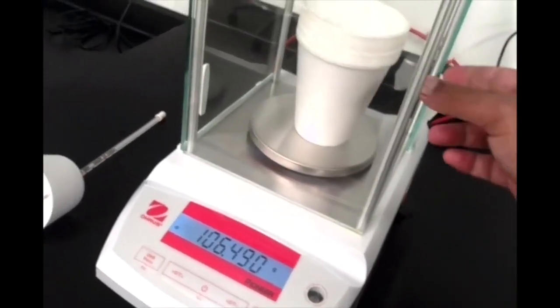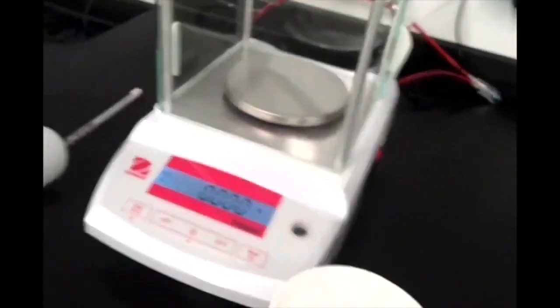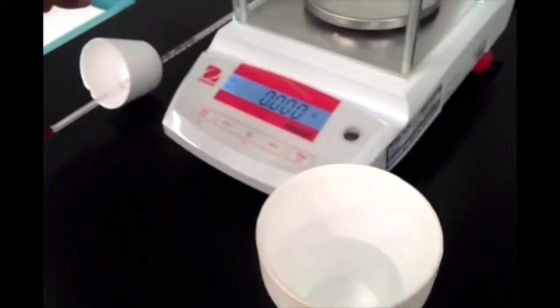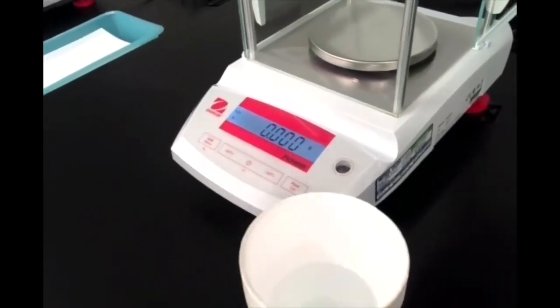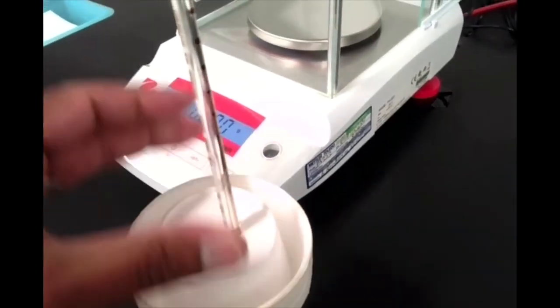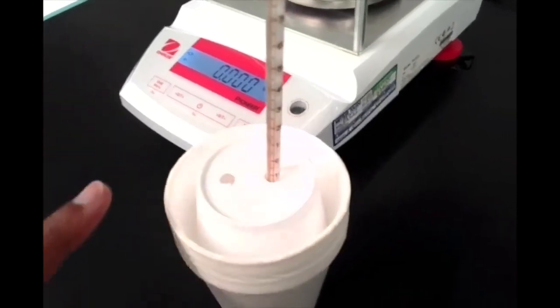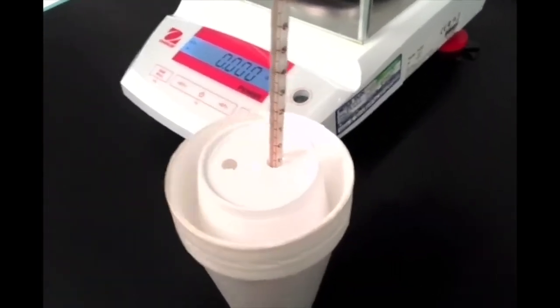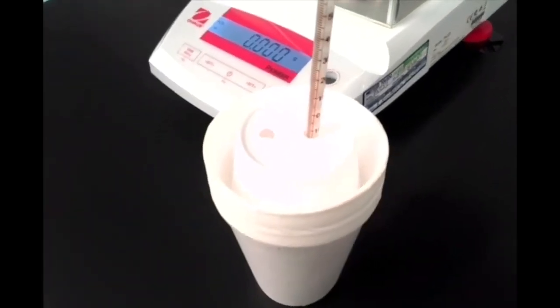Now in addition to this, we also have to figure out the temperature of the water. Because remember, in order to figure out the amount of heat being transferred here, we have to look at the change in temperature. So I'm going to add a thermometer here with another piece of styrofoam cup. This kind of helps insulate our apparatus here to stop any heat entering or leaving that might affect our results.